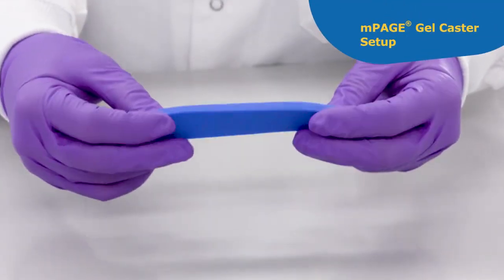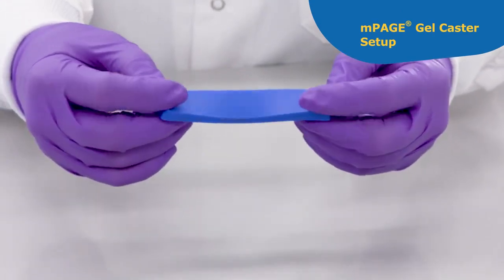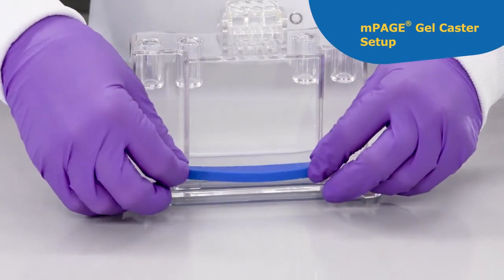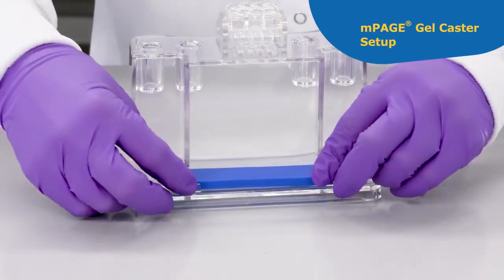Inspect the gel sealing gasket for defects. Place defect-free gasket between the alignment tabs on the bottom of the gel caster base.